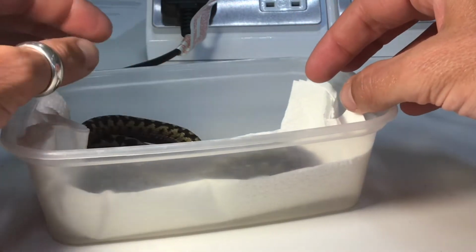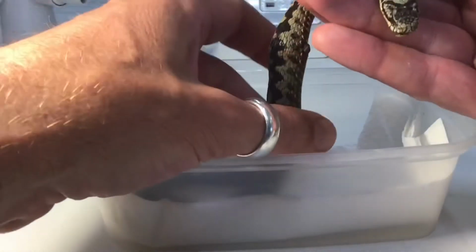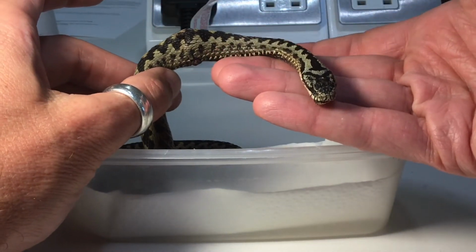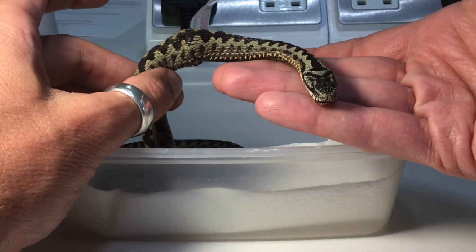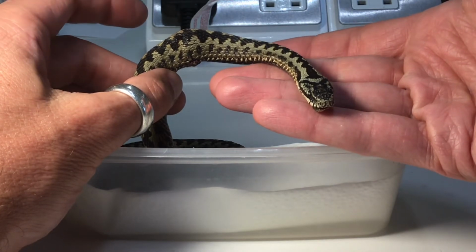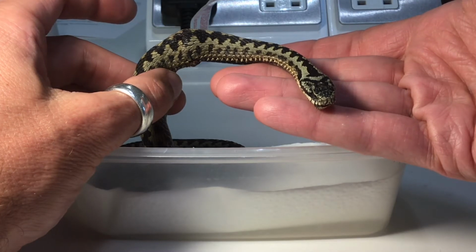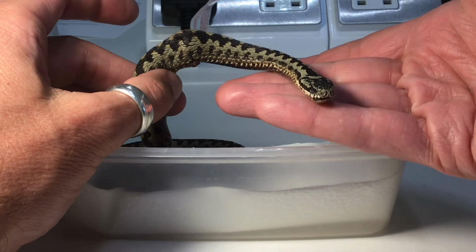I will show you some stills and show you what the fangs look like, which is something I was interested to see just now. And then what we're going to do is, because this is in such good condition, I thought I would try and preserve it as a wet specimen. Now, I've never done this before, but I'm going to attempt this for the first time, having watched a few YouTube videos, as is the way to learn things these days, but also having looked at some guides for specimen preservation. So I'm going to make up some formalin, preservative or fixative, and we're going to preserve this guy in a jar.